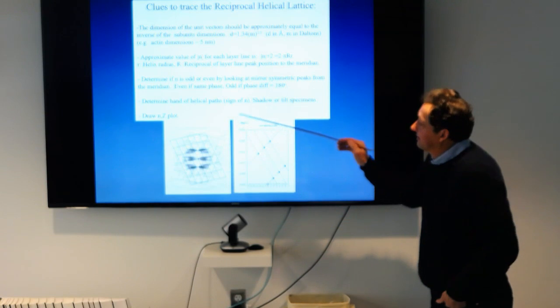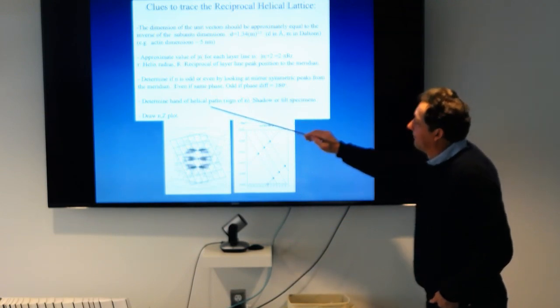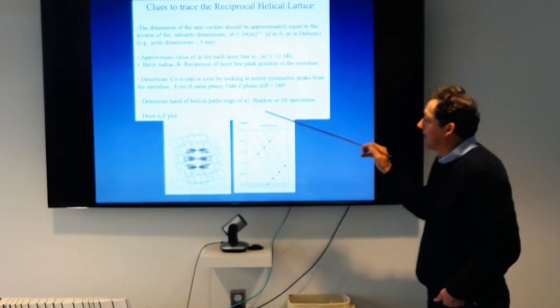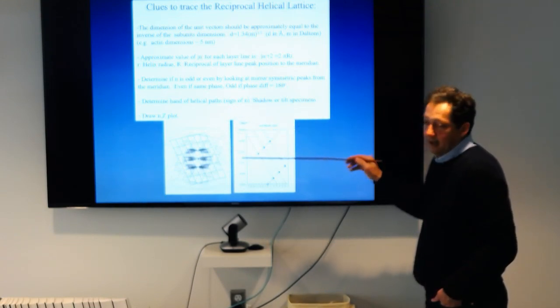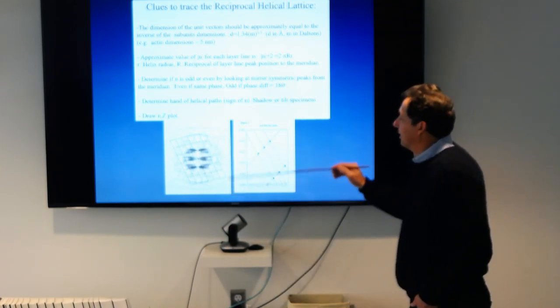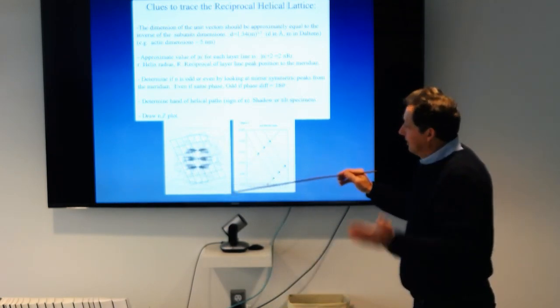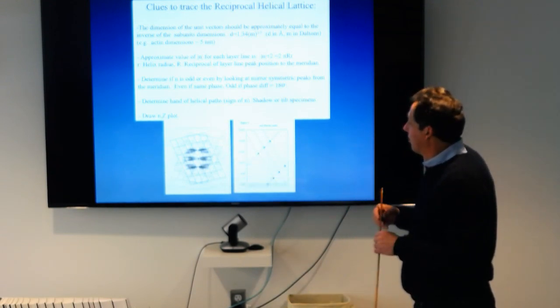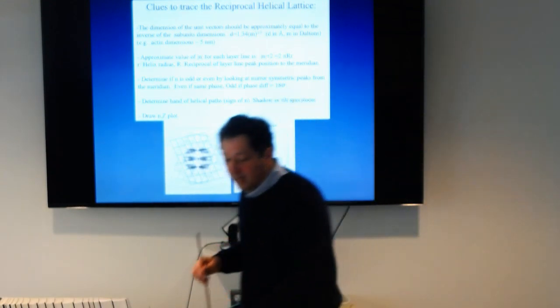And the other is the sign. Depending on the hand of the helical path, you assign the sign of n. So you could have the 2 or the -2, depending on whether the helical path is left-handed or right-handed.